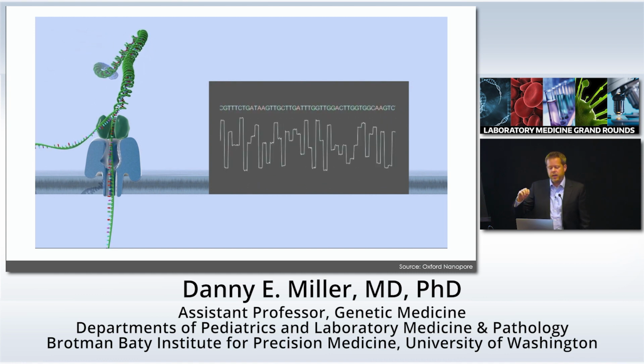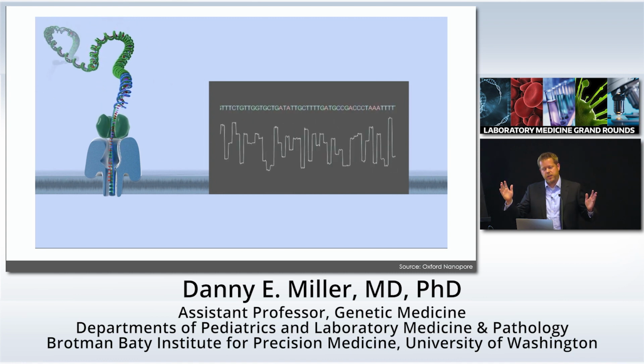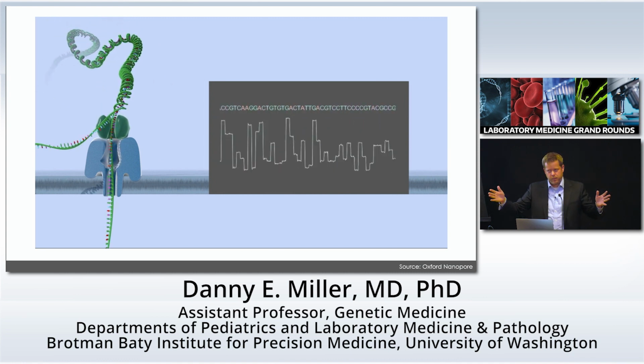What's nice, there's a couple nice things. The pore doesn't care how long the DNA molecule is. So if you could isolate an entire human chromosome 1, you could sequence it from telomere to telomere if you could get that single molecule through that pore.